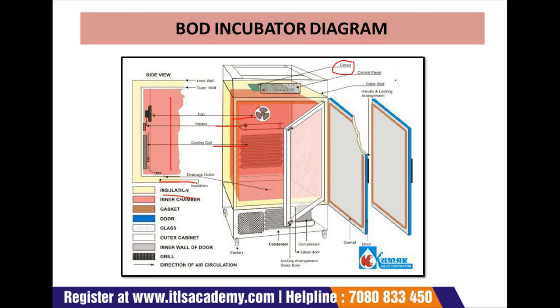Previously we saw the outer picture of the BOD, and now we are seeing the inner picture of the BOD, and this is the control panel. And now the outer wall is there, and this is the arrangement of the door. And now this is the compressor, the glass door is there, and the locking arrangement of the glass door.